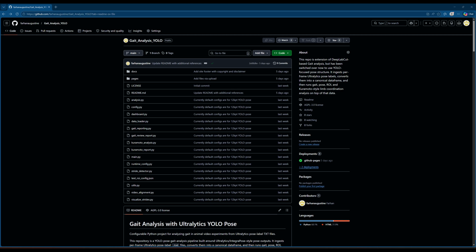It's been a long time since I posted a video to this YouTube channel. I wanted to revisit one of the repos, which was the gait analysis using DeepLabCut. In that repo, I showed how to use DeepLabCut's foundational models to do gait analysis. I next learned a few extra things and then wanted to update it.